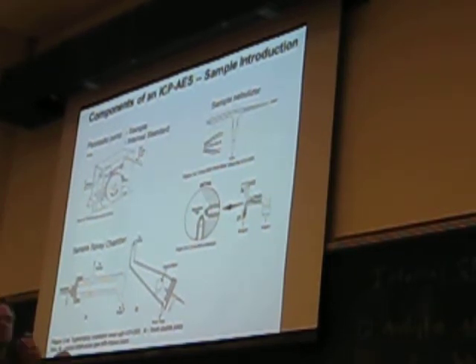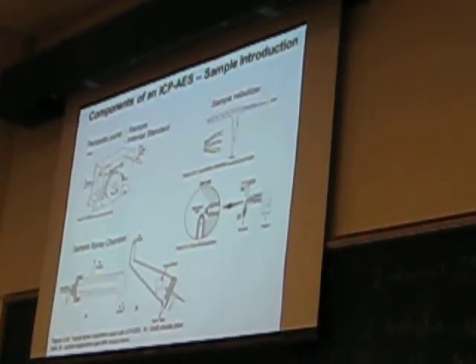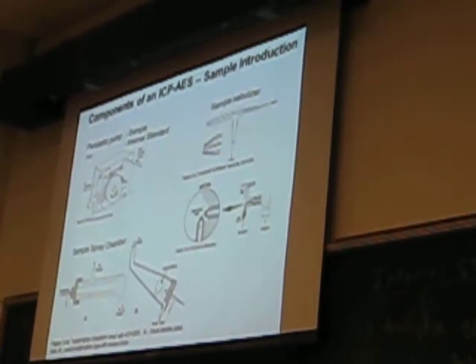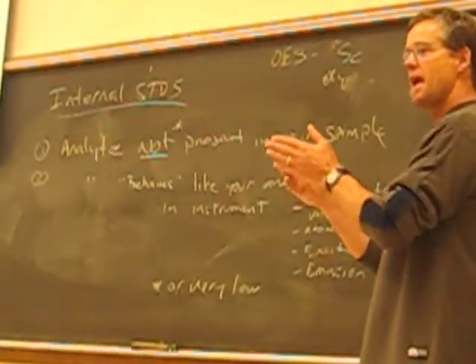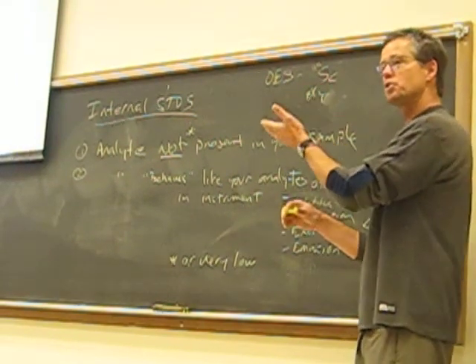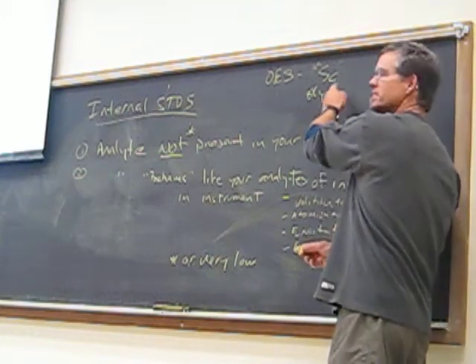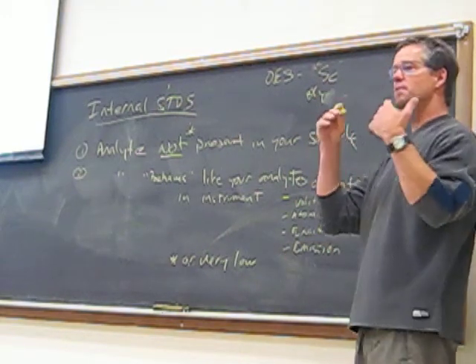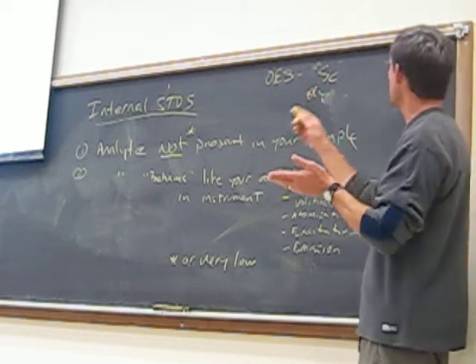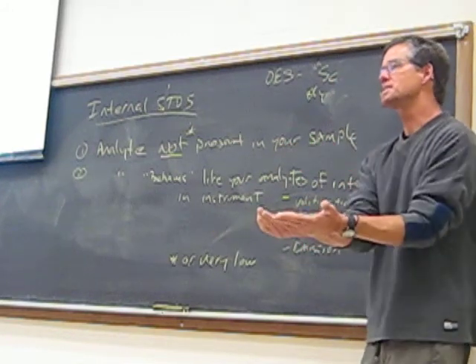And so the composition of these two internal standards that gets mixed with your sample and introduced to the instrument doesn't change over the entire analysis time. And so then you assume that if something changes from one sample to another because of the matrix, and I get less ionization or less excitation of my analyte of interest because there's a lot more stuff in there, then the same thing will happen to my internal standards. And if I normalize the number of counts per second, the signal that I get from my emission spectra from my sample, and normalize it to this, if these go down, they go down, but if I normalize them together, we get the same signal, right?